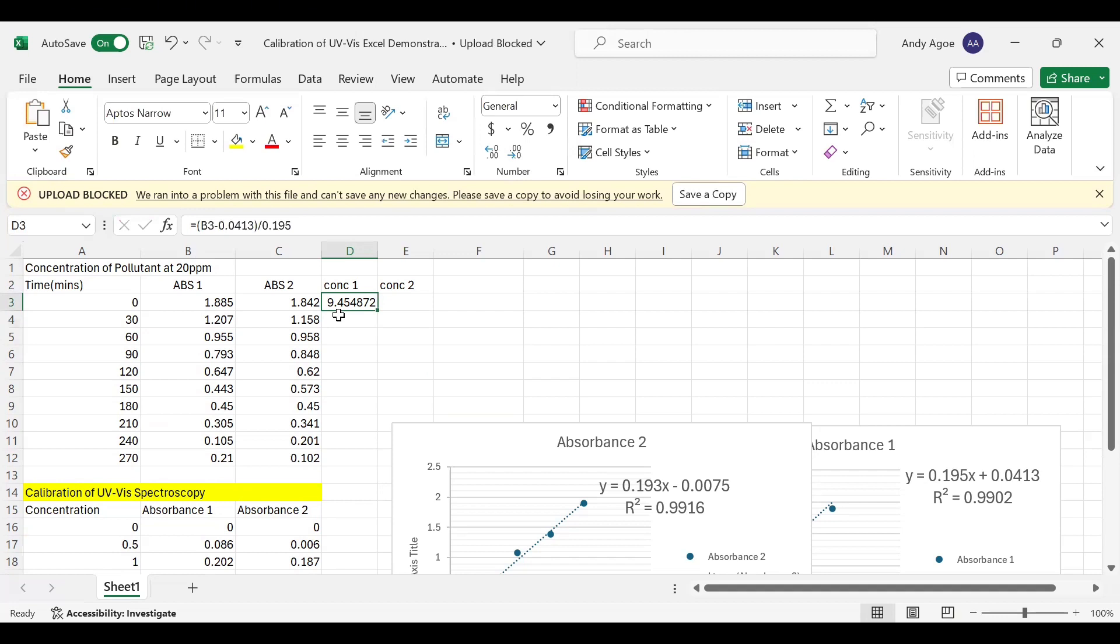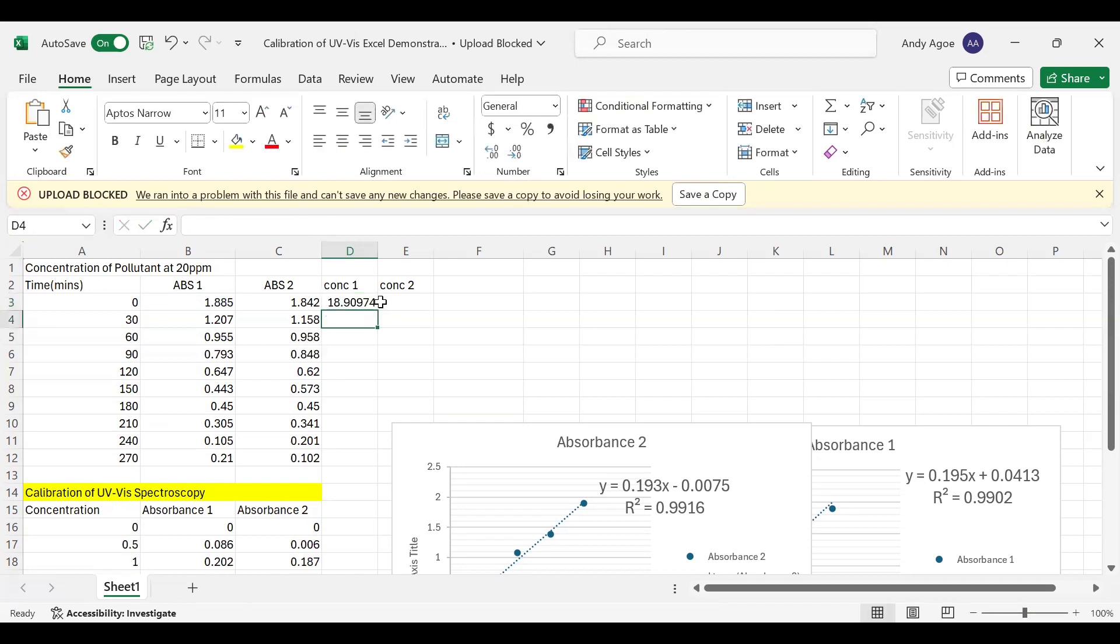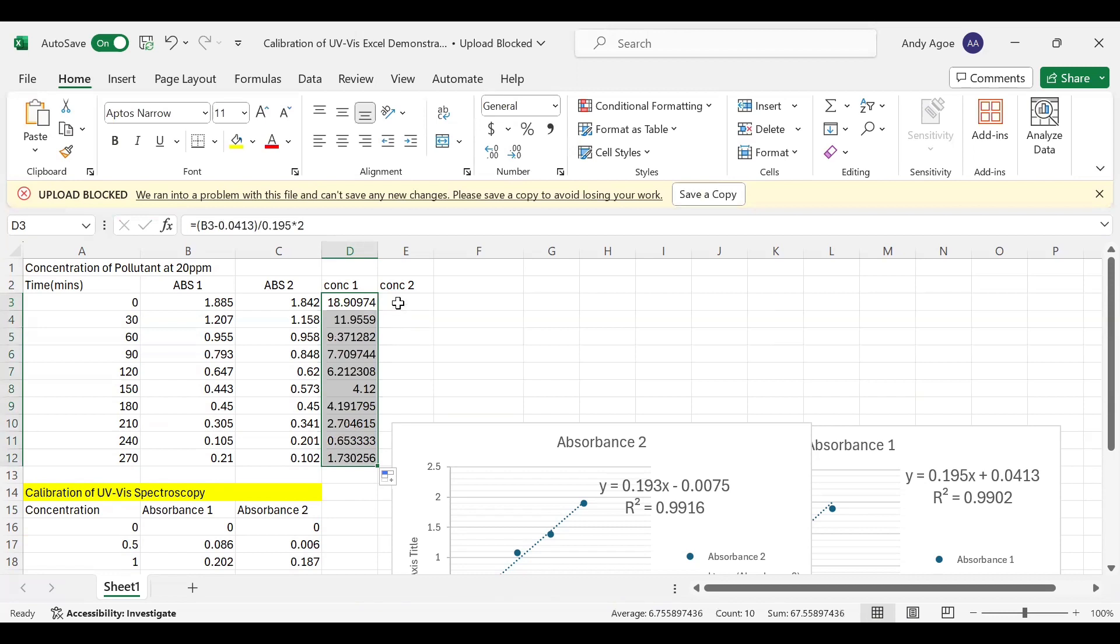However, our main target was to prepare a concentration of 20 ppm. So because of our dilution, we need to multiply by a factor of two. Then we click Enter. The next thing is autofill. Once we see this sign, we can autofill.